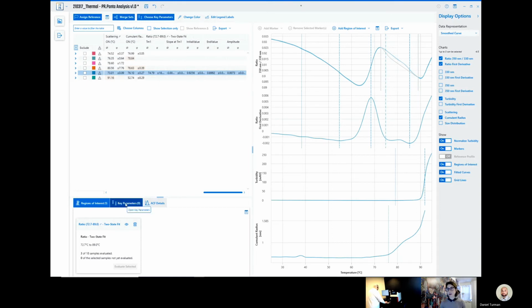Or if we do like it, we can apply it throughout the whole data set. If you're interested. Oops, sorry. No, that's okay. Go ahead, Leah. I was just going to say it's really great to select that region of interest, and if, again, you have 100 samples, to just automatically apply it to either the ones you want or all of them without having to do it for each sample. Definitely. And you can get rid of the grid lines. Dan's favorite part. Yes, it's much cleaner, but no one believes me or agrees with me.